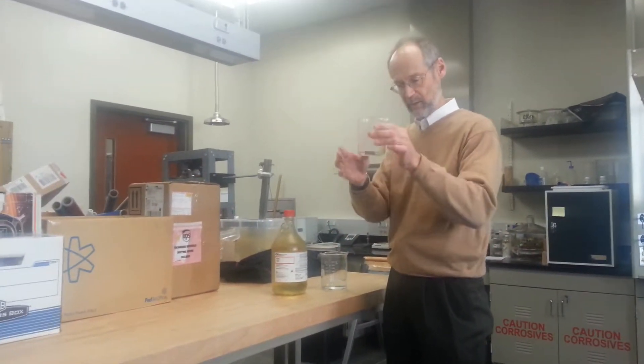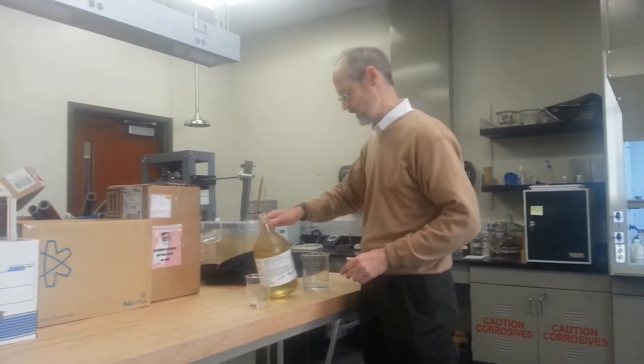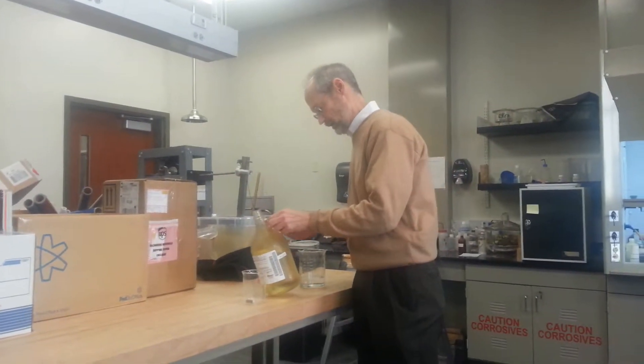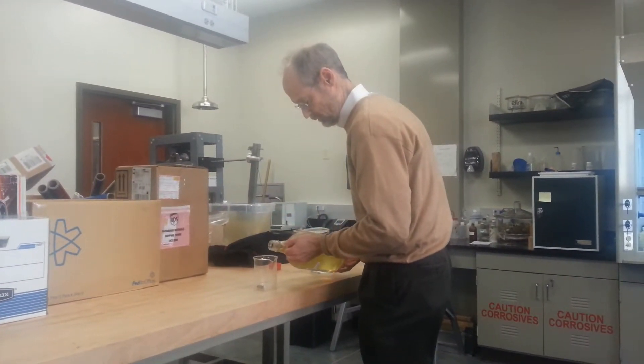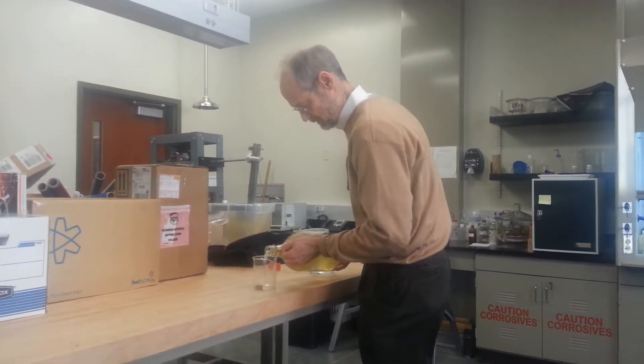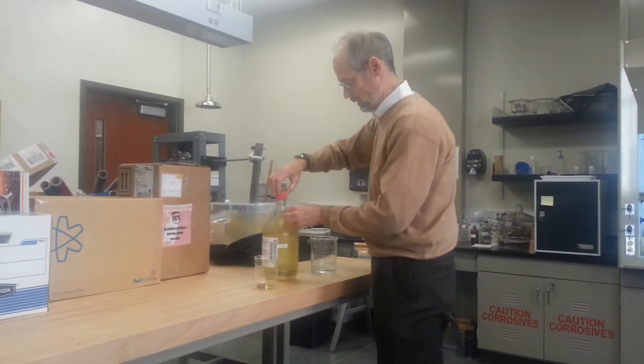A piece of carbon steel and an empty beaker at this point, and here I have a container of concentrated nitric acid, which I'm going to pour on top of the carbon steel that's in there until it's covered, but just barely covered. And so there we go.